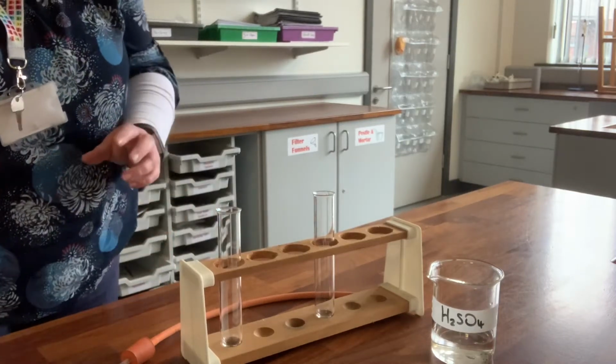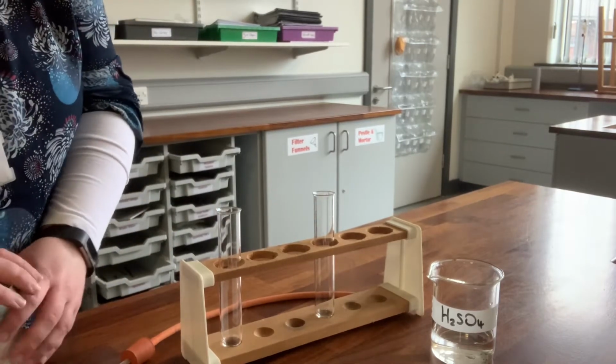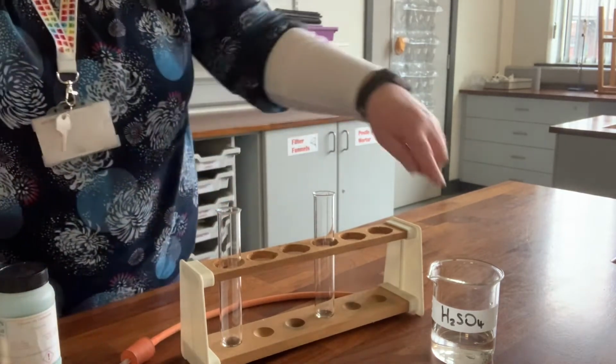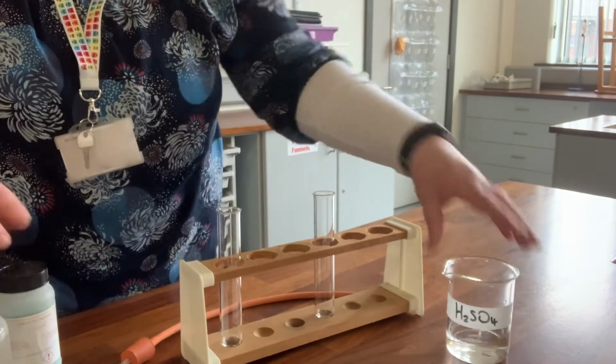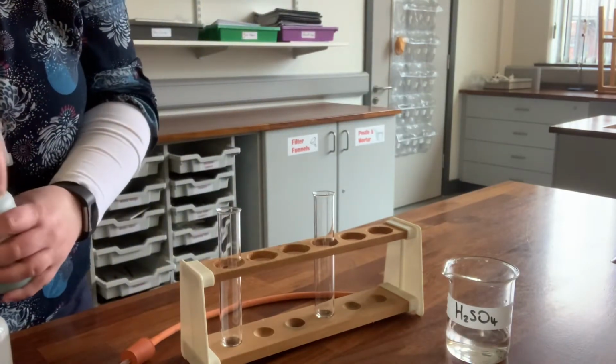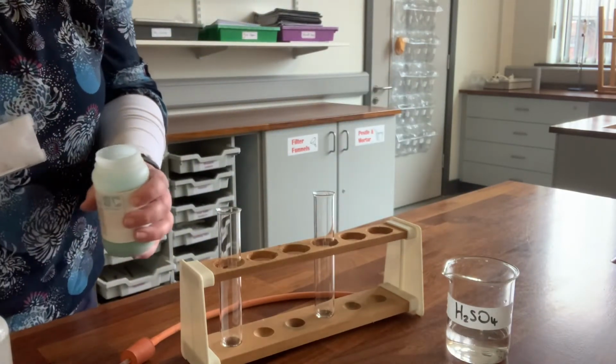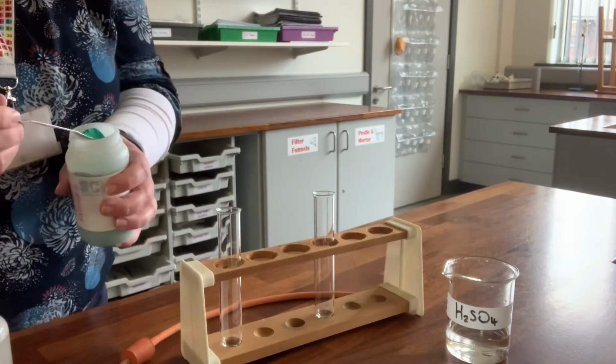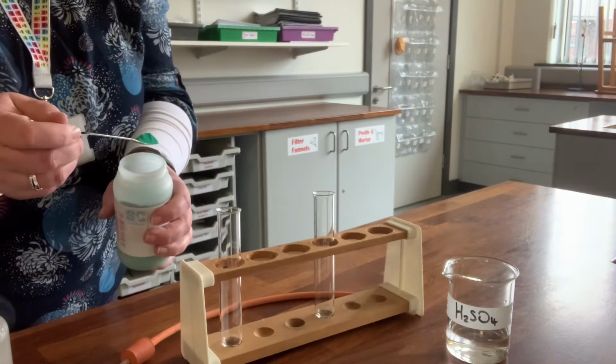So this is the second neutralisation reaction I'm going to show you today, and this is the apparatus that I need for it. So I am going to use sulfuric acid again, which is a colourless liquid, but this time I'm going to react it with copper carbonate. So you may remember that copper carbonate is a green powder, a really fine, nice green powder.